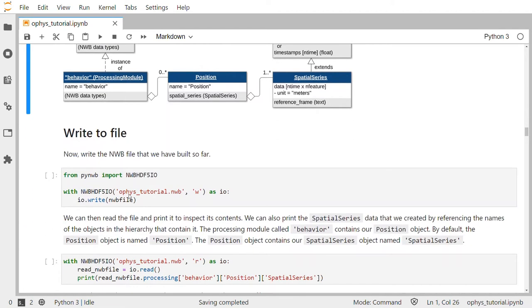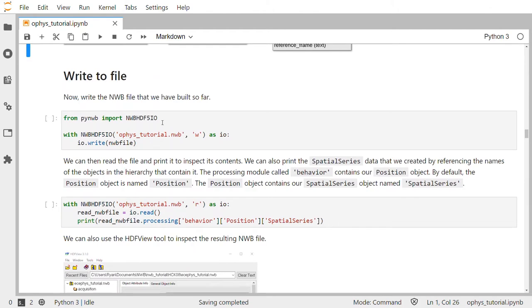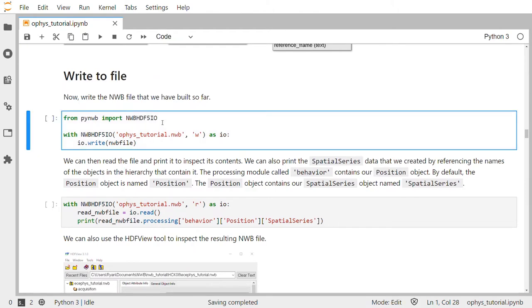Now let's write the NWB file that we've created to disk. To do that, we will import the NWBHDF5IO class from PyNWB. IO tells you that it's a class for reading and writing files, and this class will read and write NWB files using the HDF5 backend. HDF5 is a common storage format for large-scale scientific data. We'll create a context manager using with NWBHDF5IO, pass the file name, and pass 'w' to open the file in write mode. We'll get an IO object and call write on it, passing in the NWB file we created.